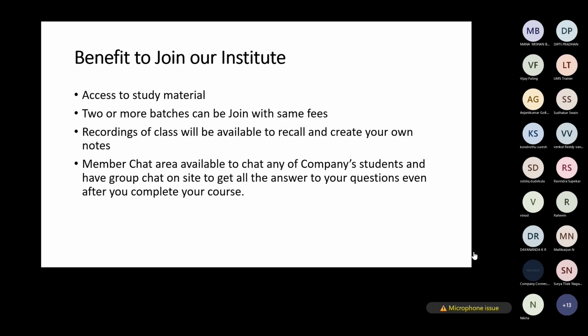So you said LabWare has its own language. Is it very tough or easy? I mean the code. Very easy. See, nothing is tough. I mean, can I compare it to JavaScript or a bit less? You can compare, but JavaScript is something completely different, right?